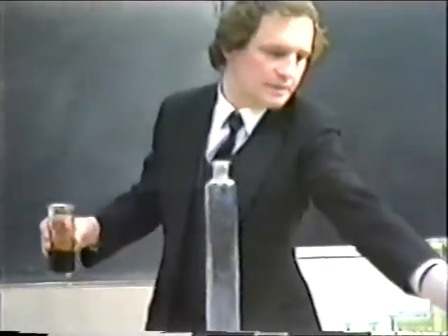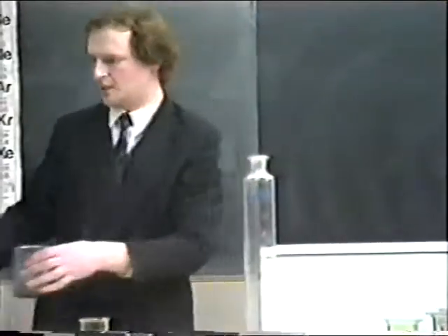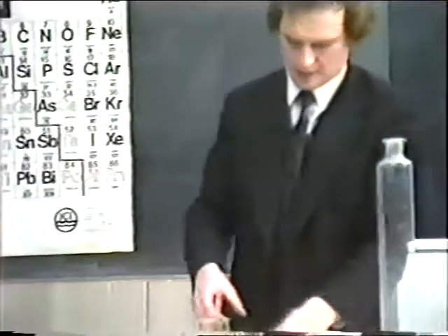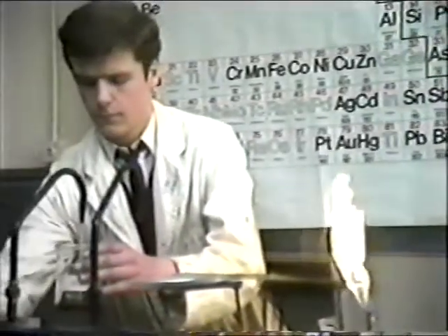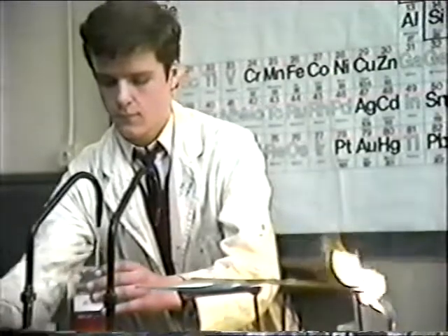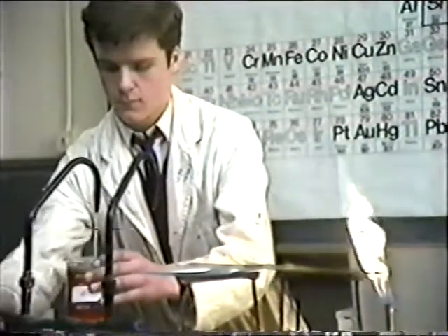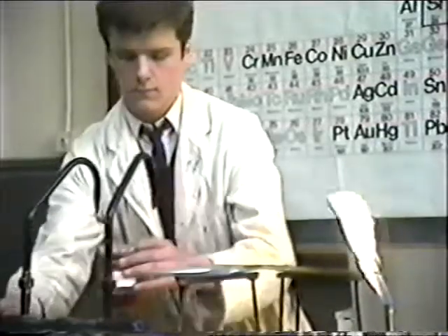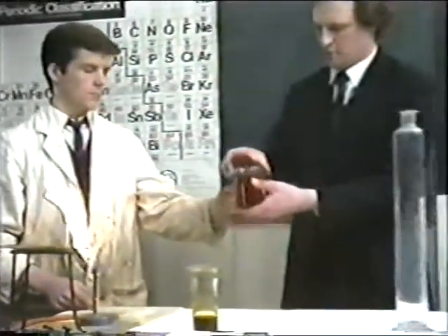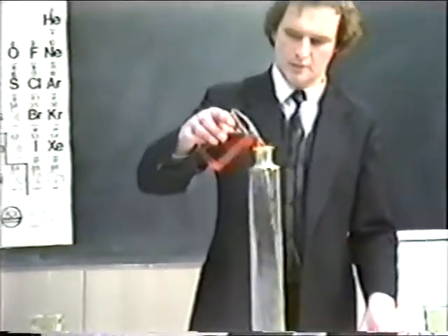Could I have a beaker? Yes, that's okay. I shall now dilute this with a fairly large quantity of water. Could you dilute it for me, Grant? Thanks. I shall dilute this with a large quantity of water in order that the colour may be less dense. Yes, more. Top it right up with water. Plenty of water. That's perfect.